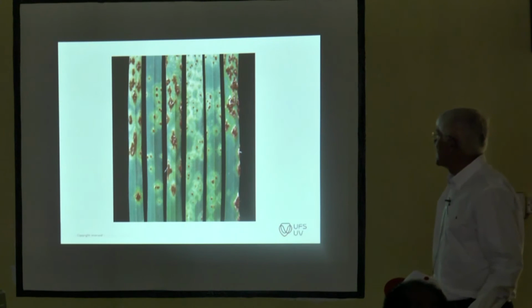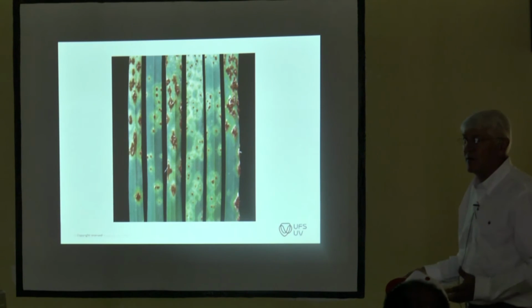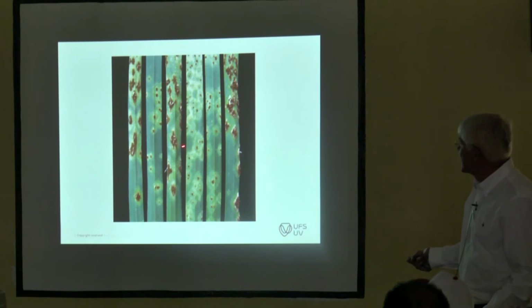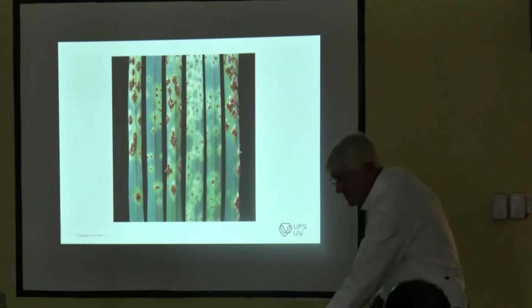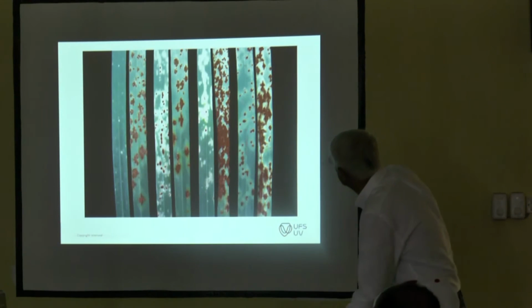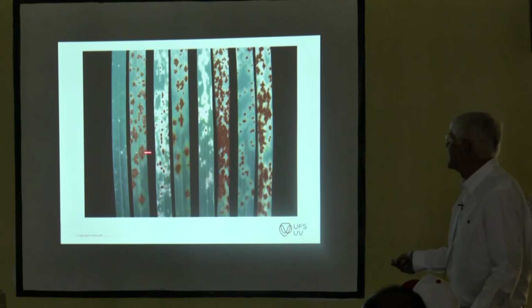Another wheat stem rust example, this is the SR9H gene. That's how it is expressed. It could be a 1 or a 2 on the 0 to 4 scale. And compared to your susceptible checks, quite clearly you can see the difference. Low versus high. These are pairs with different races. The names of the genotypes I don't think are important. But again, you can see low versus high.